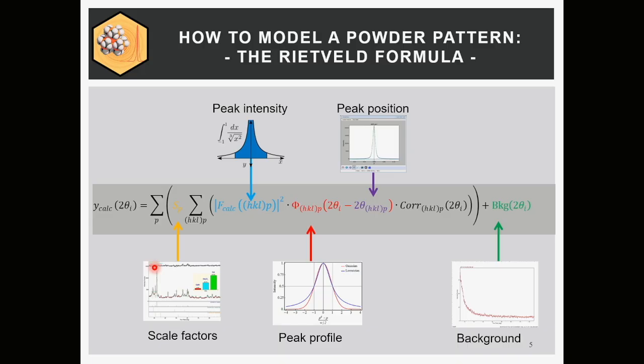So you have to find a measure of how far out you calculate a peak, okay? And the typical thing that you do nowadays, which is very well accepted, is that you calculate the peaks as far as until they are 1/10,000th of the peak maximum. If it falls below that, we stop. Okay? So Rietveld programs actually have to make these lists. We come to this later.